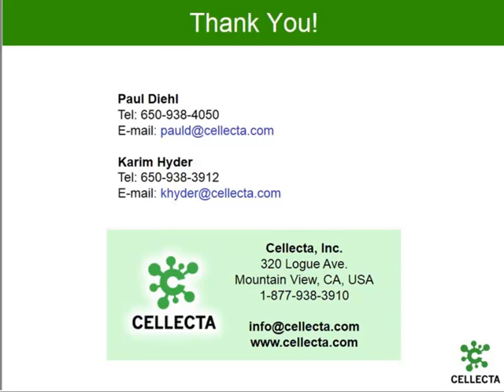The problem is if you go really high, if you went, of course, to MOI 3 or 5 or something like this, where you're getting most of your cells with 3 or 5 different sgRNA constructs, then in that case you may have a problem. But when you have a small percentage of cells that are infected with two different effectors, it's not really a problem because what you're looking at are independent. Does that make sense? It does.